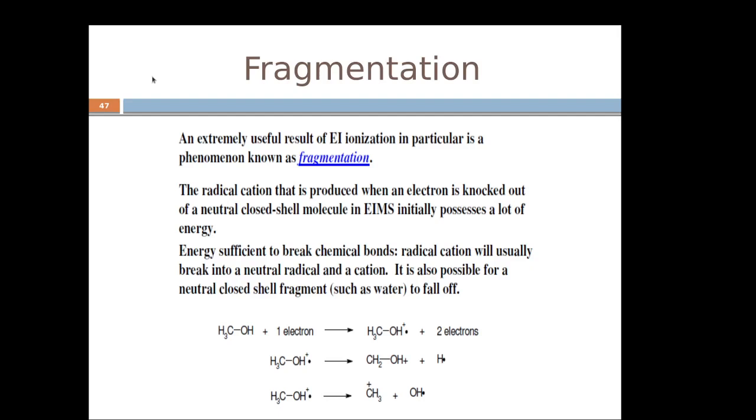Dear students, in the previous class, we have seen different methods of ionization procedures in mass spectrometry, and these ionization procedures can result in different types of fragmentation patterns. We are going to explore various kinds of fragmentation patterns and what kind of fragmented molecular units could form out of these ionization techniques. And we are mainly going to focus on the electron impact ionization.